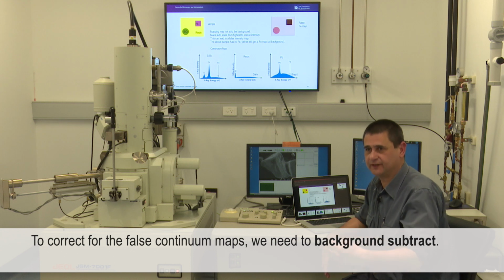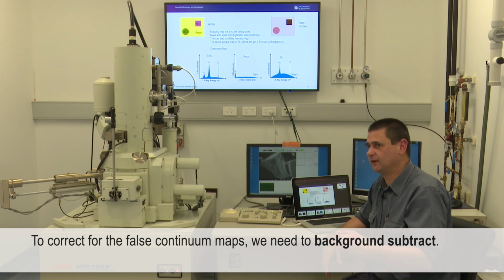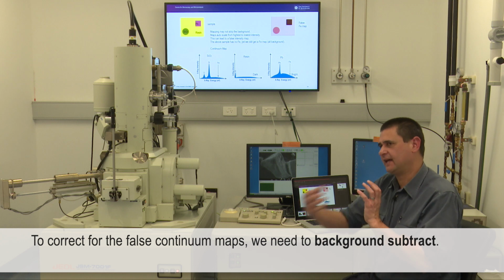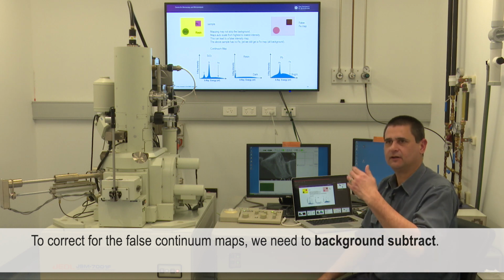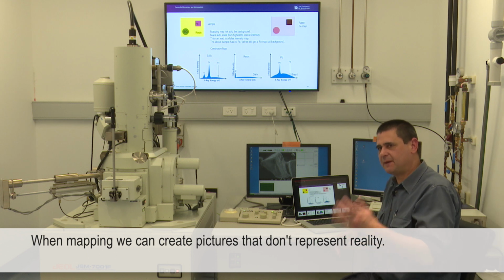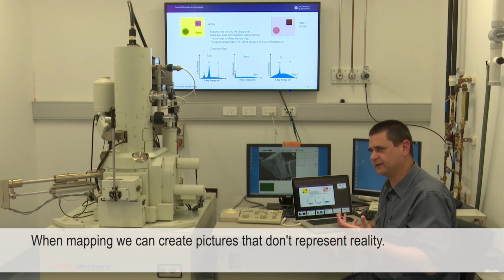Some software does it automatically. In some of the older software, I would map an element that wasn't present. That's my continuum map, and then I would subtract that continuum map from my real maps. Just be aware that when mapping, you can create pictures that don't represent reality.